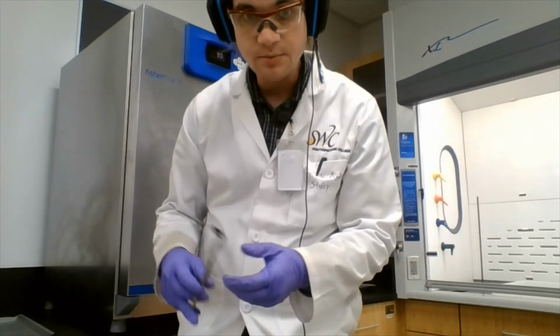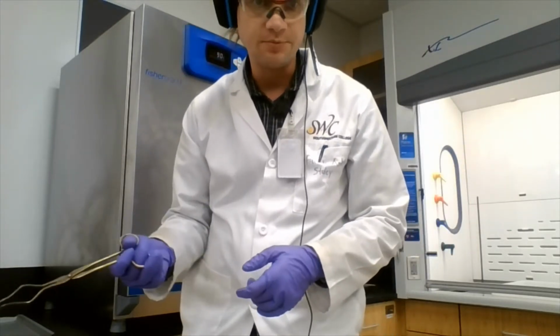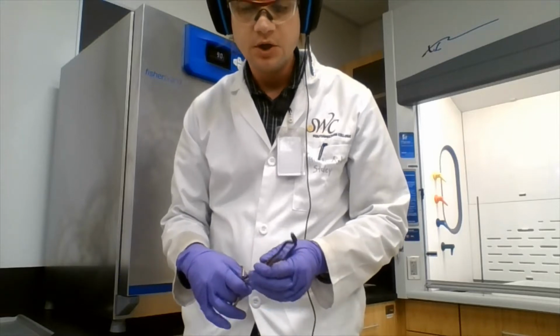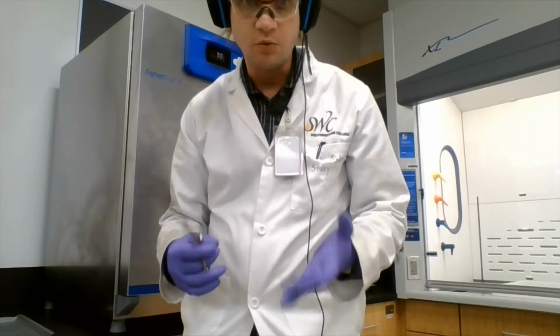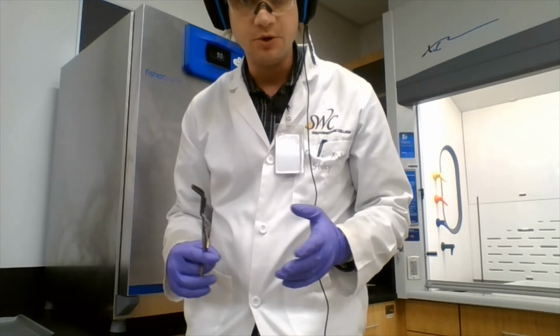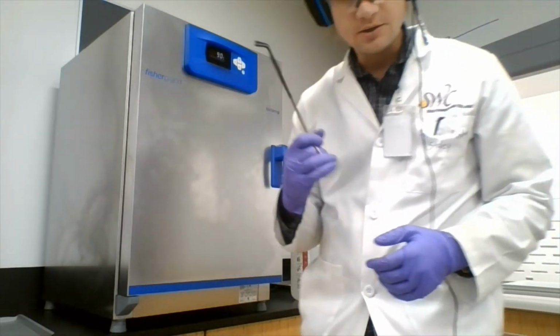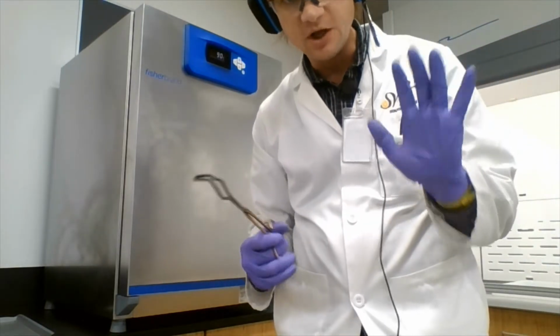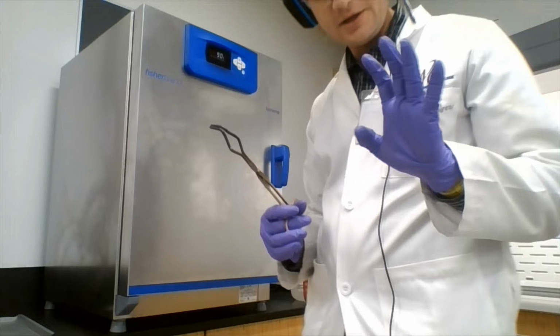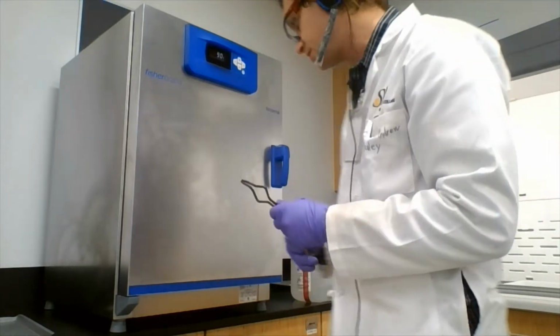Now, when taking them out of the oven, it's important not to touch them with your skin, partly because you don't want to get burned, and also partly because you want to make sure that the amount of water present on the glass is the same as it was when you put them in the oven. So, you try to touch them with tongs or with gloved hands. Ideally gloves that don't have lint or something else that might also change the mass.